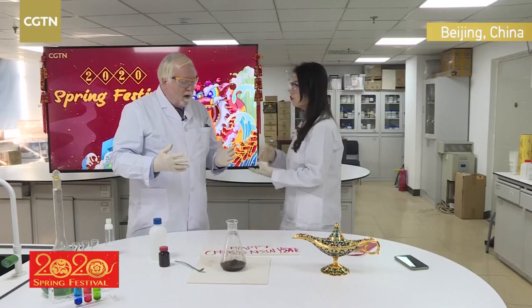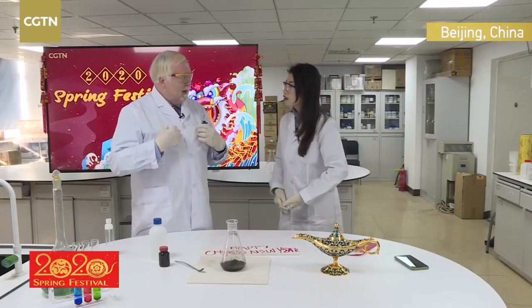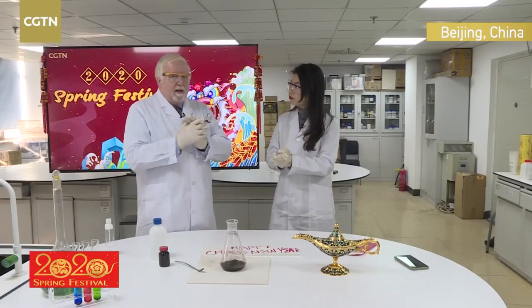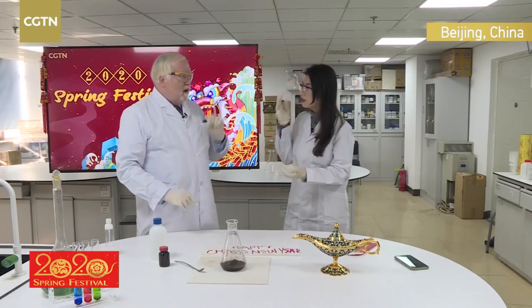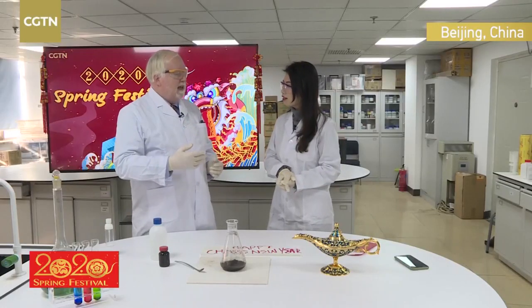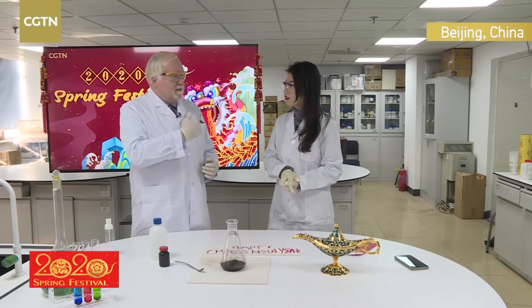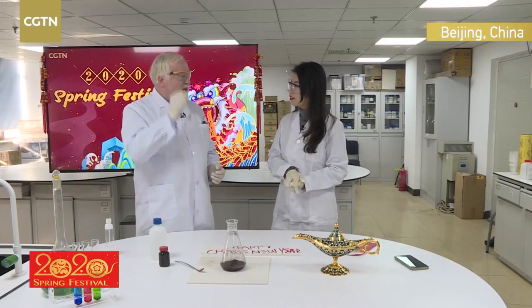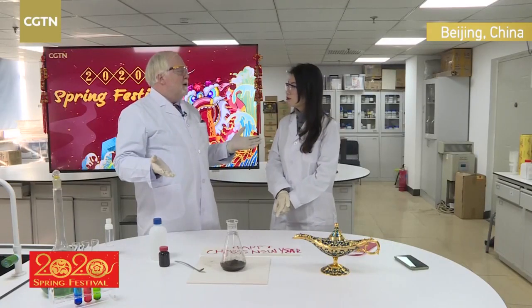So what are the rules that we need to follow? The most visible rule people associate with labs, of course, is the lab coat. Yes. And we had the gloves as well, even though we said it's not very corrosive, but for extra safety. But actually, the goggles are the most important, because the lab coat protects your clothes. If you spill something on your clothes and make a hole or a stain, you can buy new clothes. But if you don't wear the safety goggles, then your eyes may get hurt if something gets in your eye. And where do you go to buy new eyes?